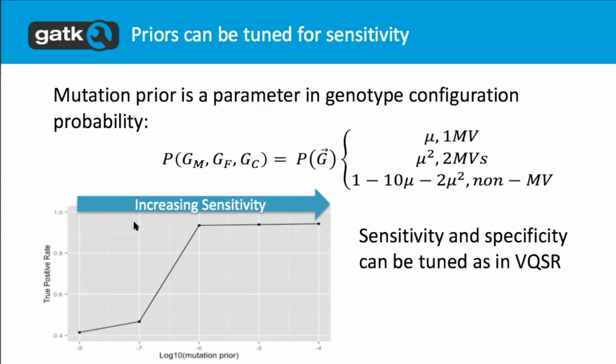But if you're working with a population that's been highly exposed to mutagens, like the Chernobyl area populations, you may assume they have higher mutation rates for whatever reason. Or if you're working with a non-human population that you're exposing to mutagens, you can tweak the model to adjust your prior of mutations accordingly.